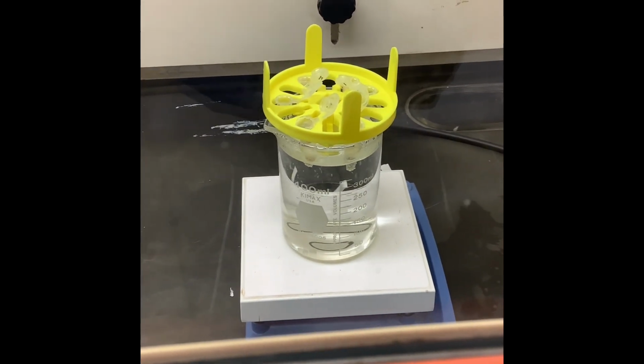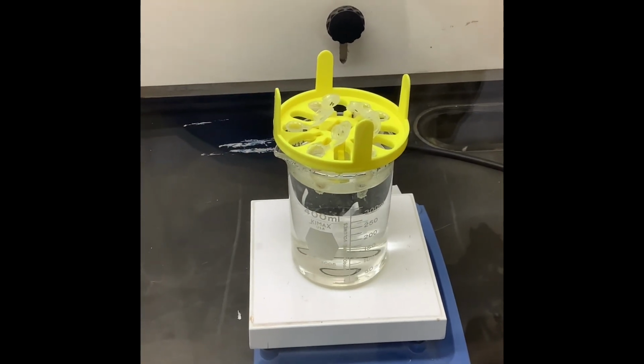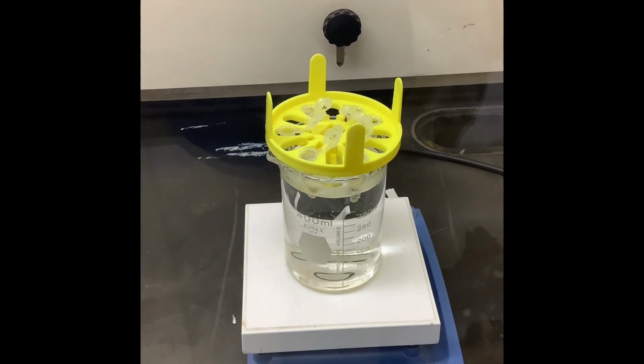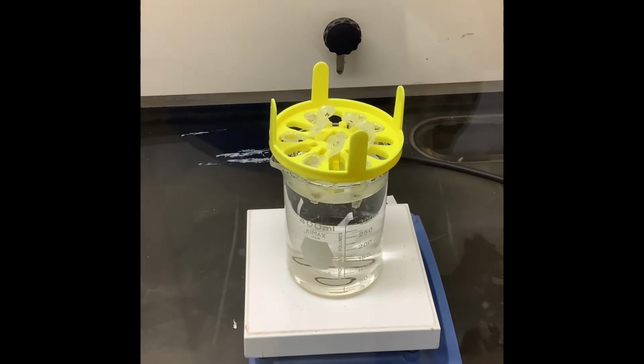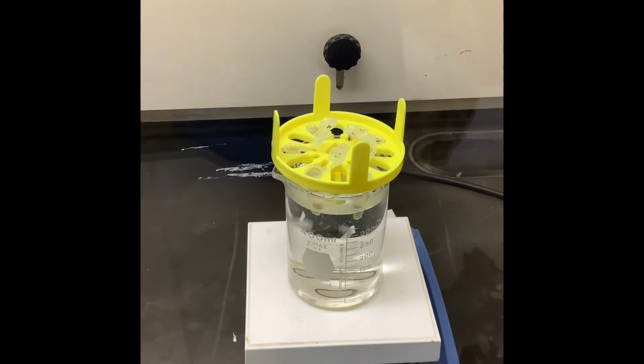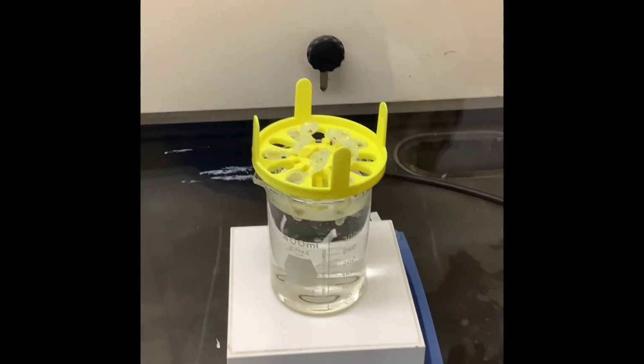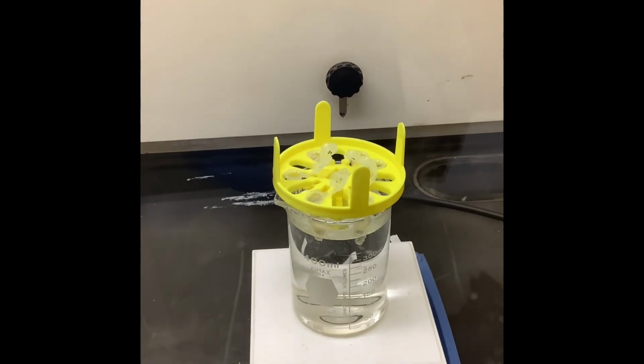The purpose of this is A, to dissolve the cotton, and B, to continue the chemical reaction. You're going to see a color change most likely in most of the samples, and the degree of the color change seems to be dependent on how much pollen is present.